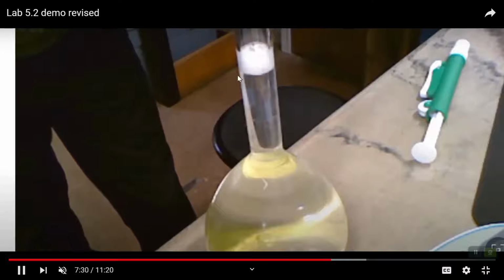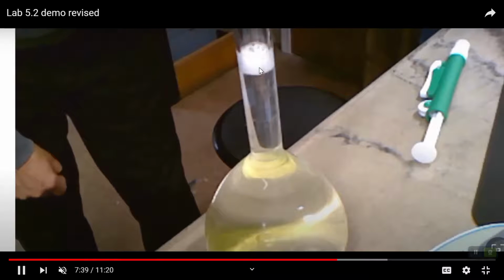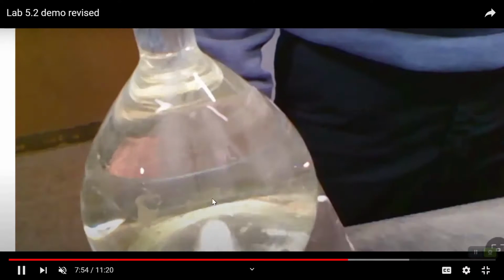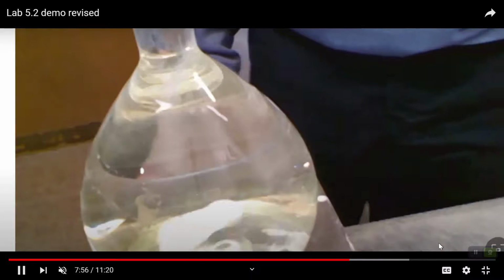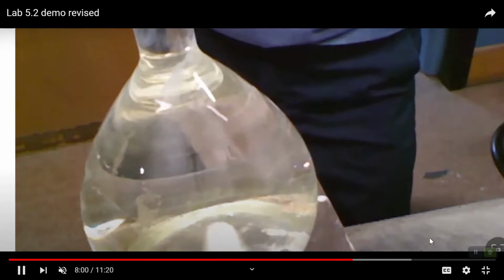So now I have added my 7.5 grams approximately of soap to the flask. I've filled the thing up with water, and you can see that it's still kind of yellow in there. It's settled to the bottom, at least some of the coloring. So I'm going to put that on a stir plate and stir it so that I bring it all into solution. But the stir bar won't change my volume, because I've already determined my volume is correct, and then I'm just going to stir that and bring it into solution. And that's how we create our soap solution.